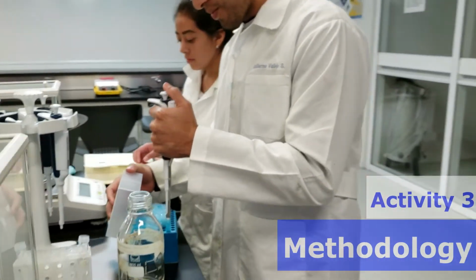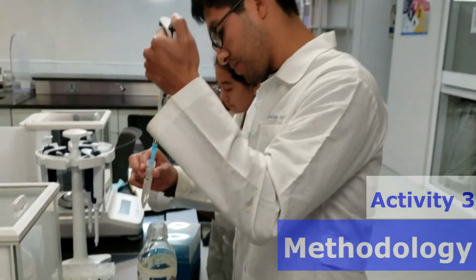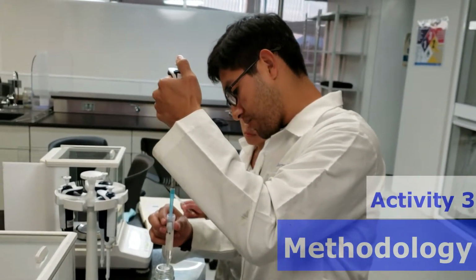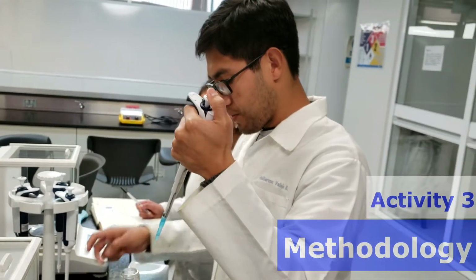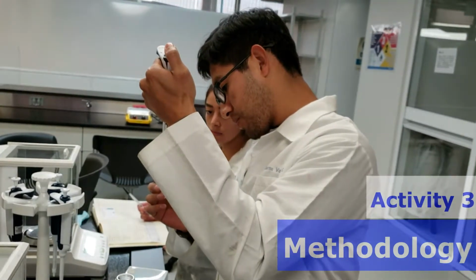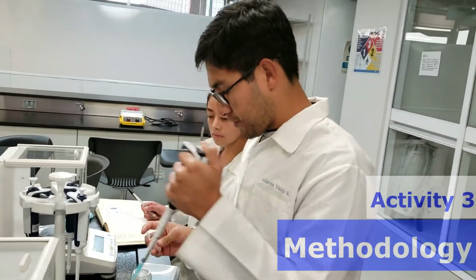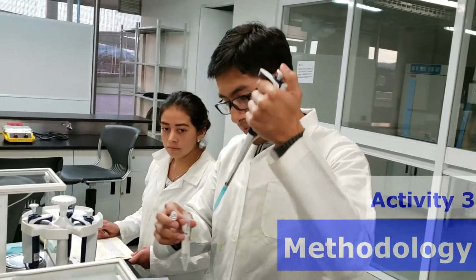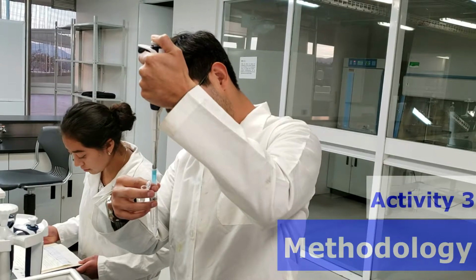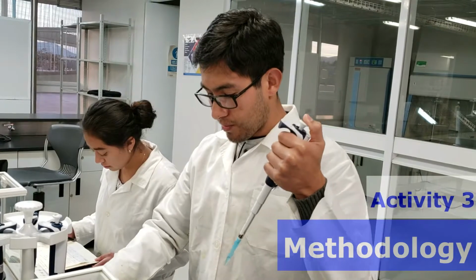First of all, the attachment of the micropipette tip has to be appropriate according to the micropipette and the volume to be recovered. Then, a specific volume of water was taken in triplicate and kept in a microtube of the corresponding volume. For a good measure of the volume, it's necessary to place the micropipette at 90 degrees to the water and avoid going too far into the liquid. These tips are useful to prevent more water than calculated from getting into the micropipette tip.